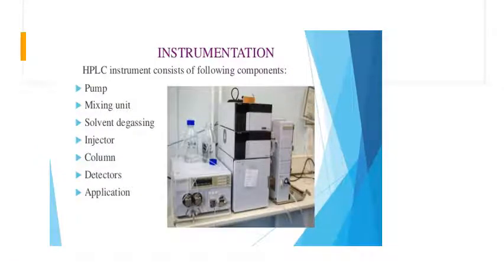Now we come to the instrumentation part of the technique. This is the HPLC instrument, which consists of various components. In the instrumentation part, we should see all the components involved in this HPLC instrument and what their function is in the analysis.